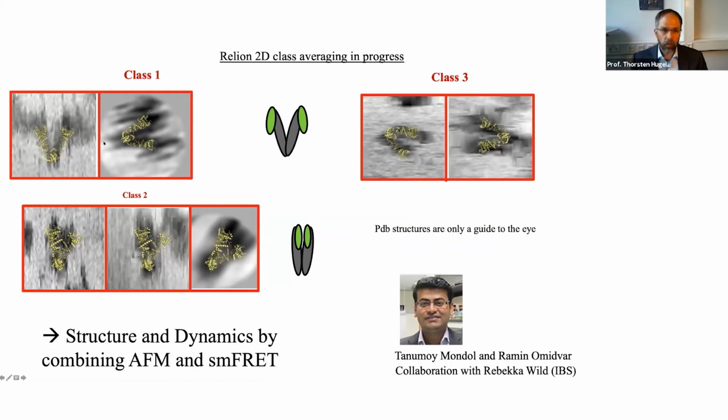And this is kind of from the first try what you get out. What I should mention, we did not only look at HSP90. HSP90 by itself, there's a crystal structure and many things are known. But HSP90 together with one of its co-chaperones, actually the one I showed before, this AHA1. And the question is, how does this structure look like?